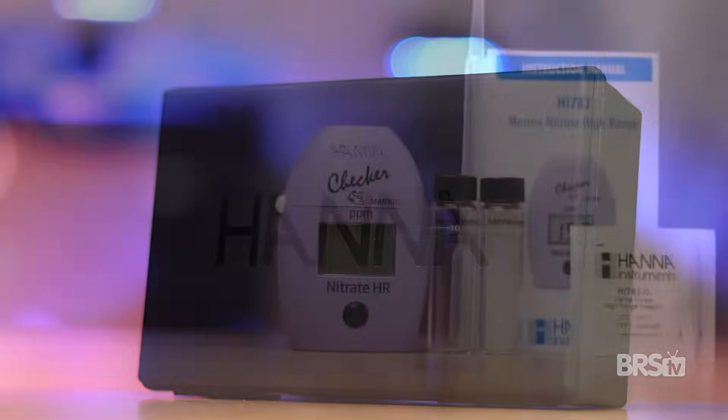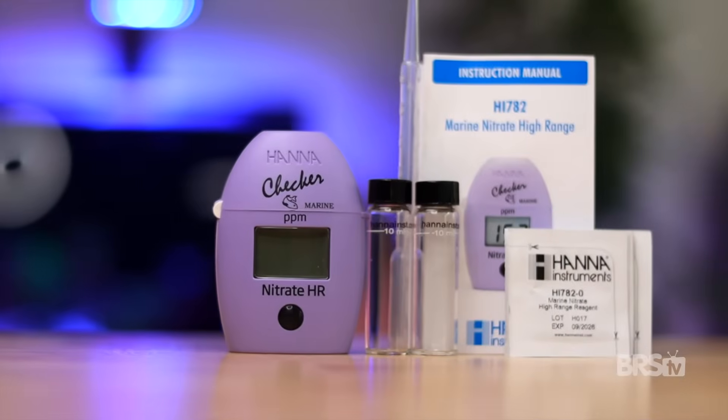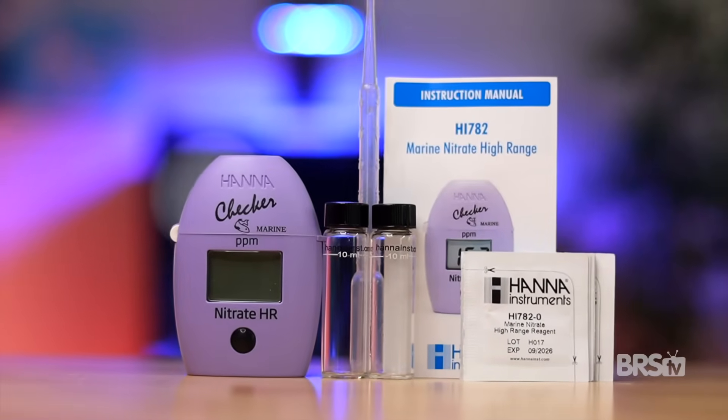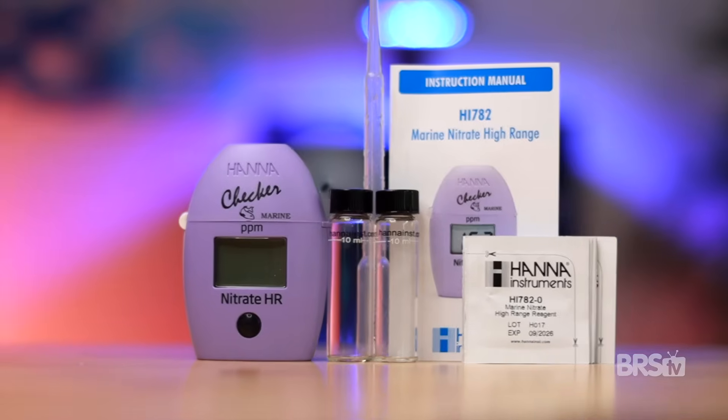Before we get into the details of how this nitrate checker works, let's see what's inside the box. The high-range marine nitrate checker comes with a hard plastic case, the checker itself with a AAA battery, two cuvettes with caps, 10 reagents, an instruction manual, and a 3-milliliter pipette.